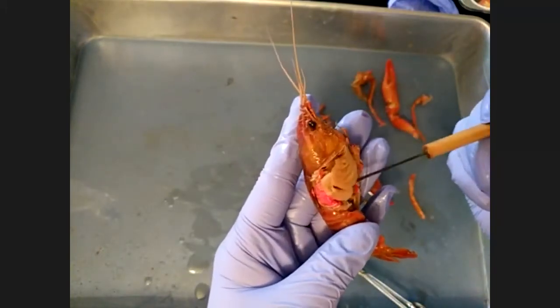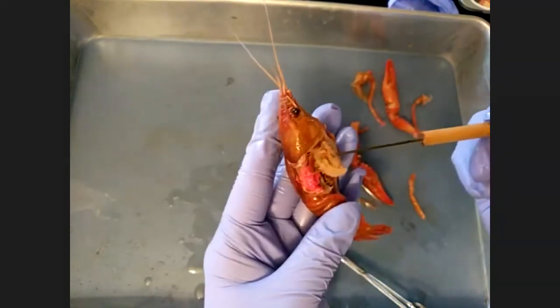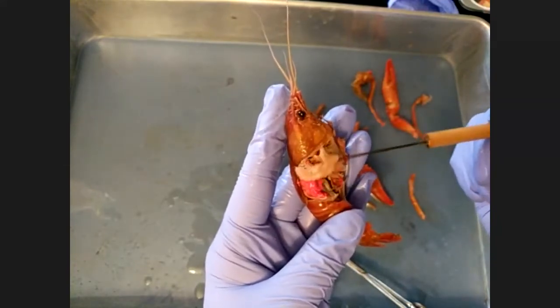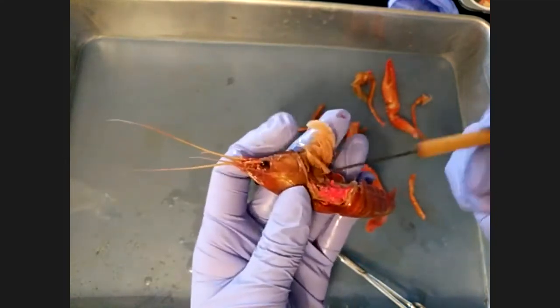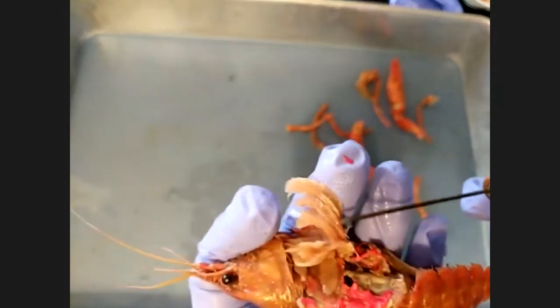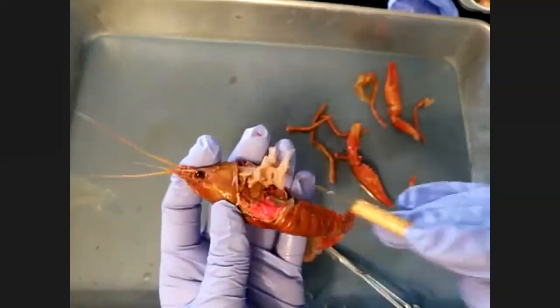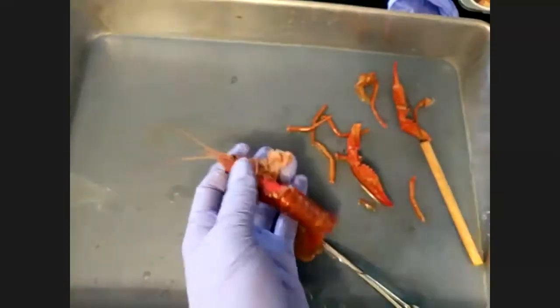What do gills do? What are they responsible for? Helping them breathe. So they're responsible for respiration. They're very feathery. And because they deal with respiration, it means that they're going to have a lot of blood that flows to them. And if we look closely, we can see some of that nasty pink stuff that I was talking about inside the gills. So I'm actually going to rip the gills out because they're in my way. I want to get closer to the other stuff.